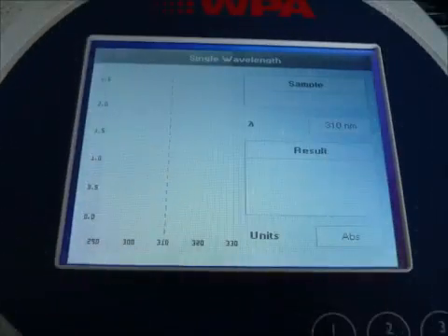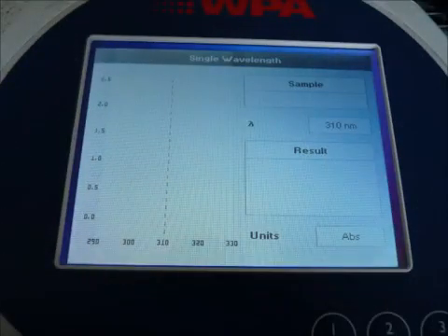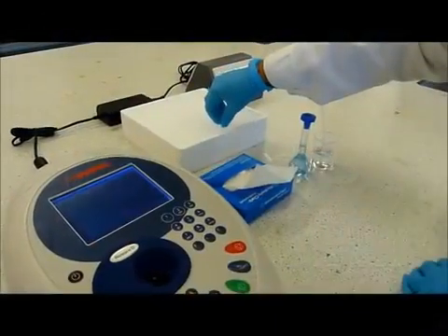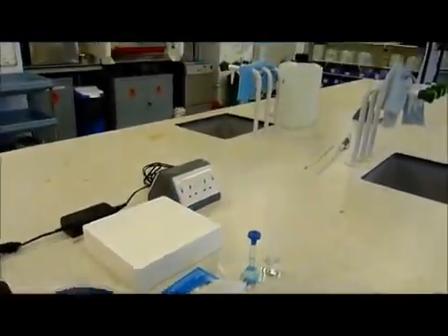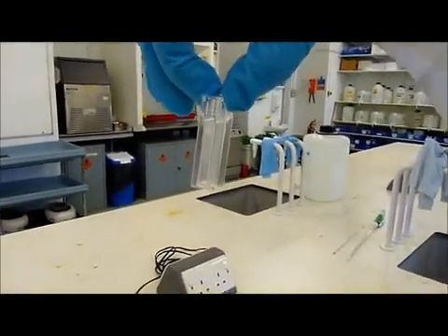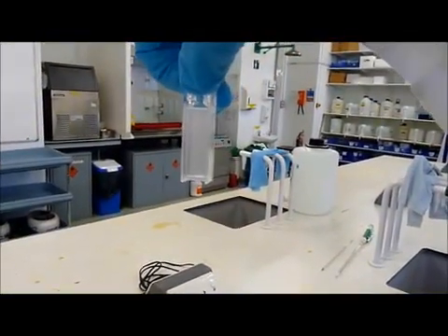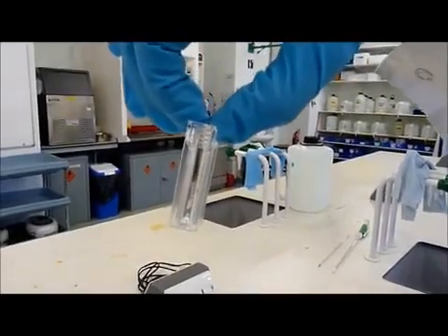Ensure that the spectrophotometer is turned on and the correct wavelength has been selected. A reference cuvette containing the same solvent as the sample is used to set the spectrophotometer to read zero absorbance.